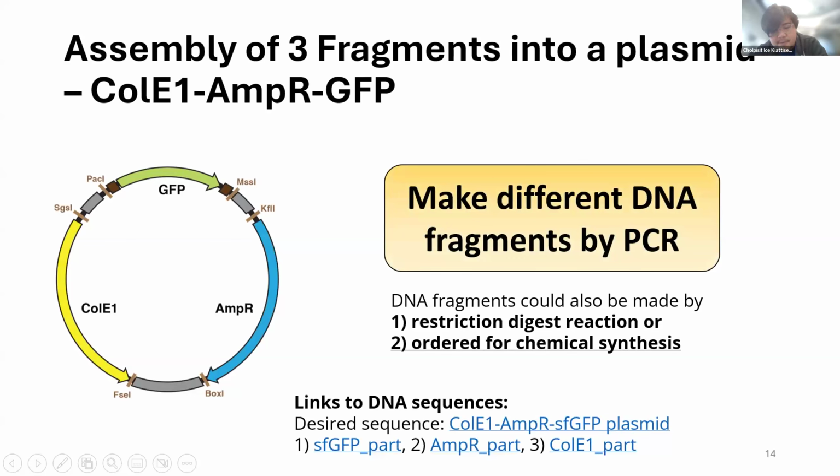Let's do a little bit of practice trying to do edits. It's going to be a big shift from the thing we have been showing here. Let's assume that we have this DNA that has ColE1 as an origin of replication, has an ampicillin resistance gene as a selection marker, and also GFP as a coding sequence to make the bacteria capable of making green fluorescent protein, as an example. If you click into the PowerPoint link here, you see these parts together.